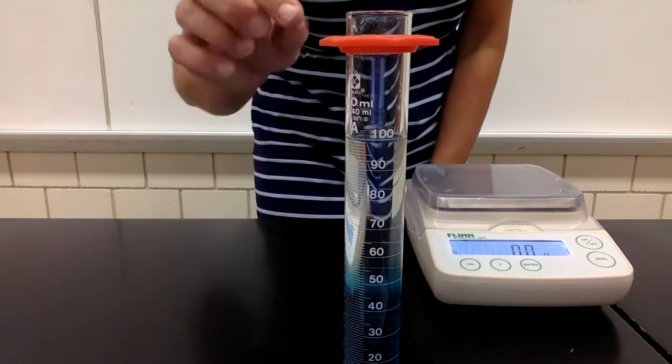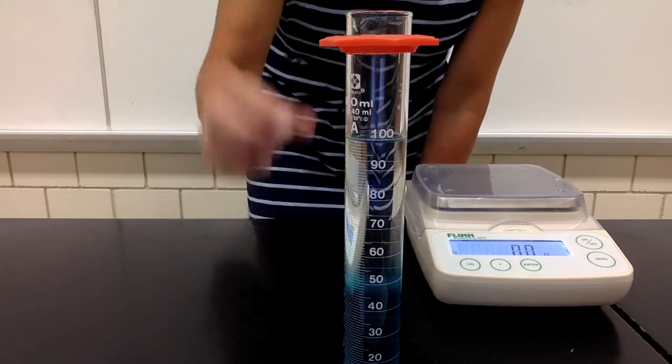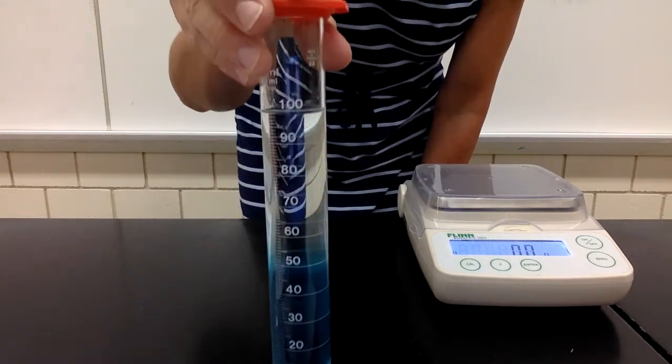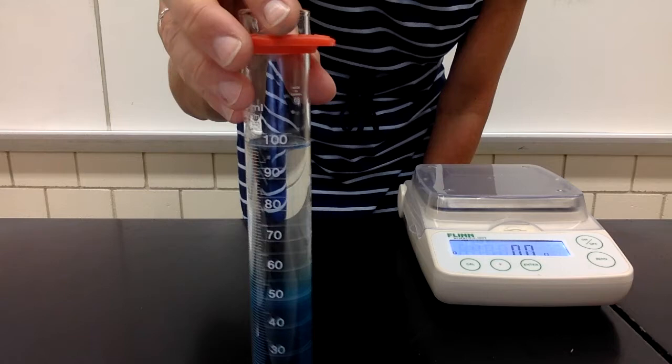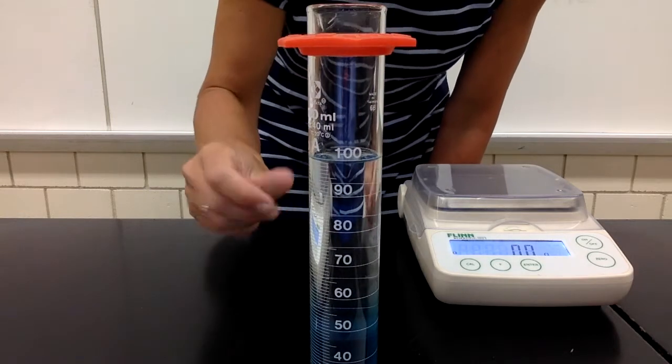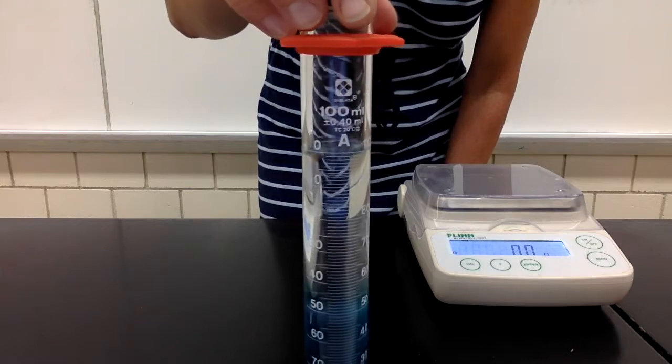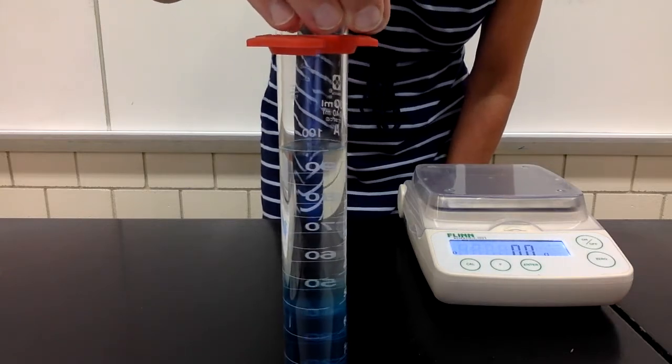So I have both liquids added together in the graduated cylinder. You can see the water on the bottom and the ethanol laying on top. And I'm going to measure the volume right now while I have them together and write it down before I mix them.